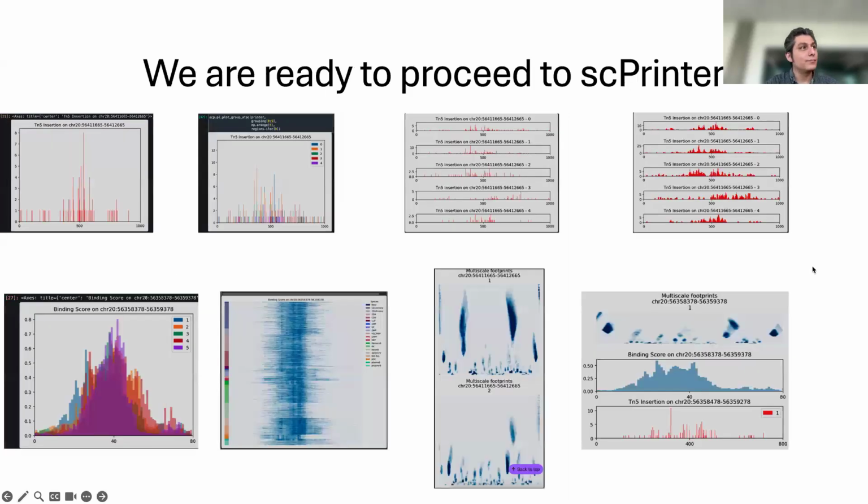What is literally on those plots? I'm sorry, the y-axis is cells, correct? And if so, how are they sorted? Right. So the tutorial, unfortunately, I don't know why they didn't label their y-axis. That's part of my own confusion. The way I'm explaining this is, they have in the paper that each row is essentially a scale.